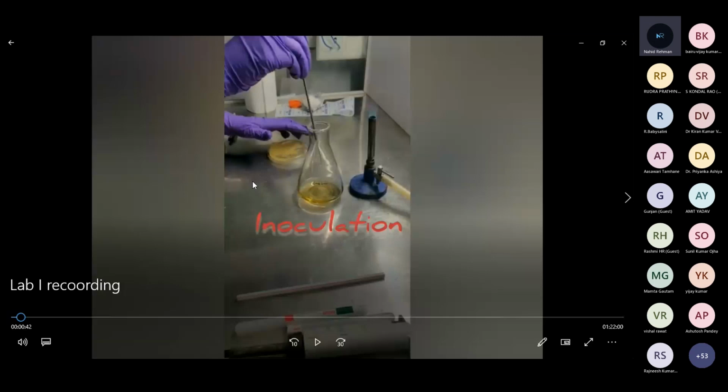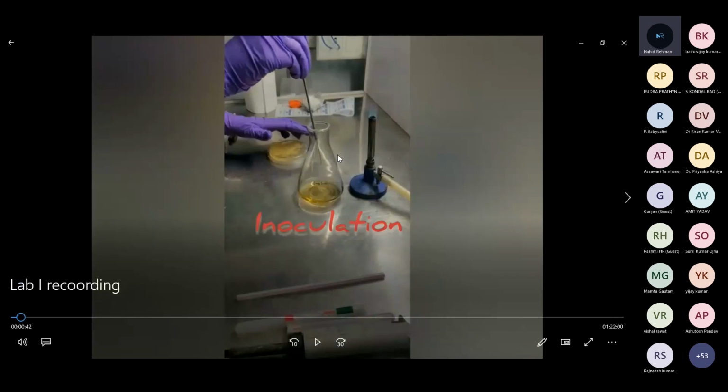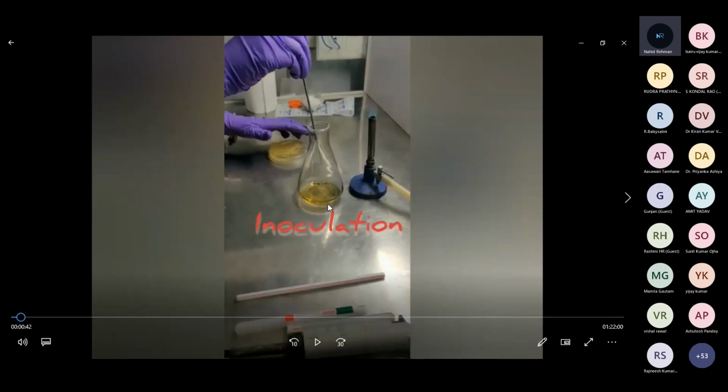So once you get the distinct colonies, then you have to grow those distinct colonies in the broth culture. Broth culture is the liquid culture, and when you grow it in the broth culture, it grows overnight, in 16 to 18 hours. Then again you just plate it over a new plate so that the pure culture is maintained. And that pure culture you can maintain in the laboratory either in the liquid condition or in the solid condition. So whenever you have to do the experiment, you always have to prepare log phase growing bacteria. Log phase means all the cells are in good health condition and they are replicating, dividing at their maximum rate.